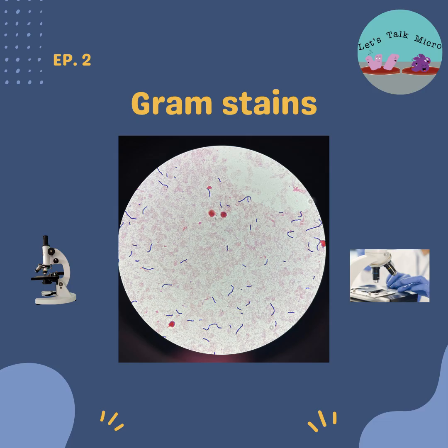And then we take MacConkey, which is another type of media that we mentioned. This one is selective and differential, right? It is selective for gram-negative rods. And like I made a point on the last episode to mention to the students, make sure that you say selective for gram-negative rods, not gram-negative.